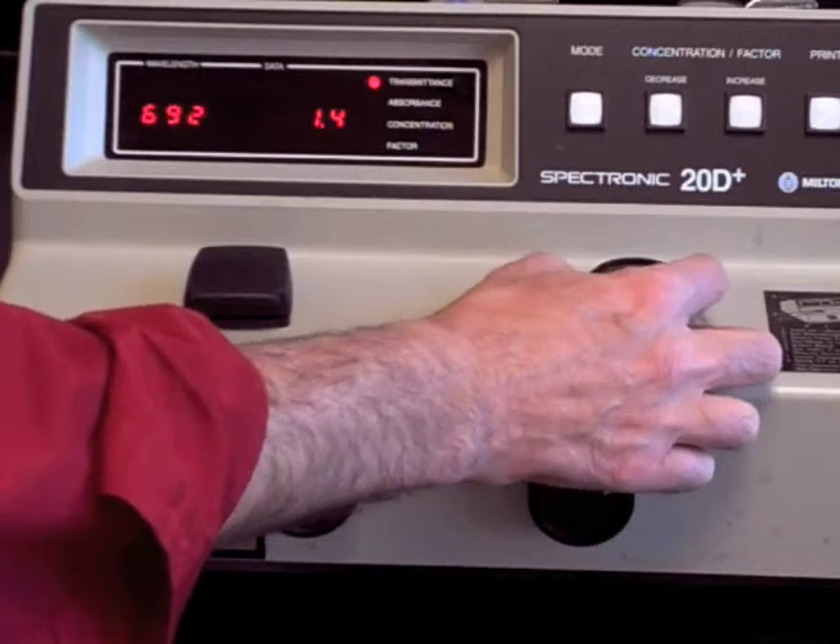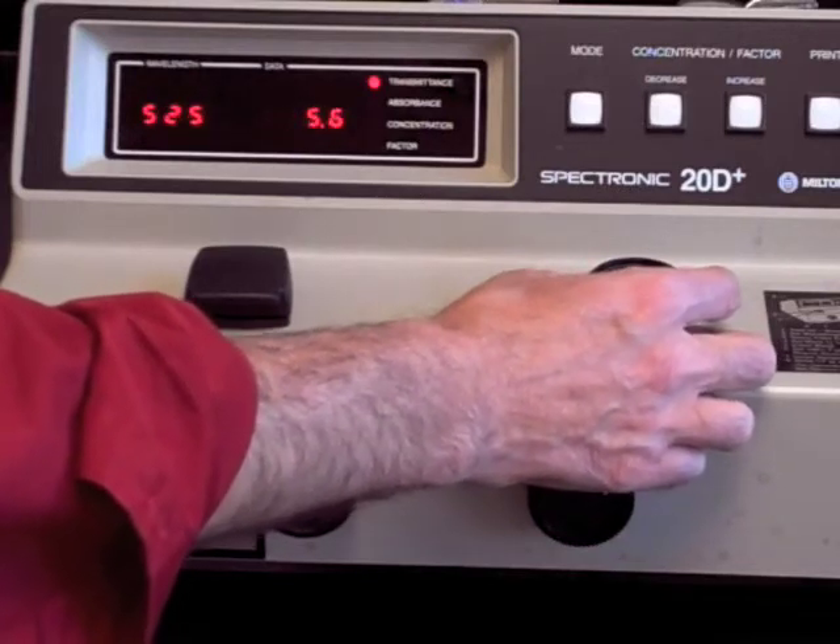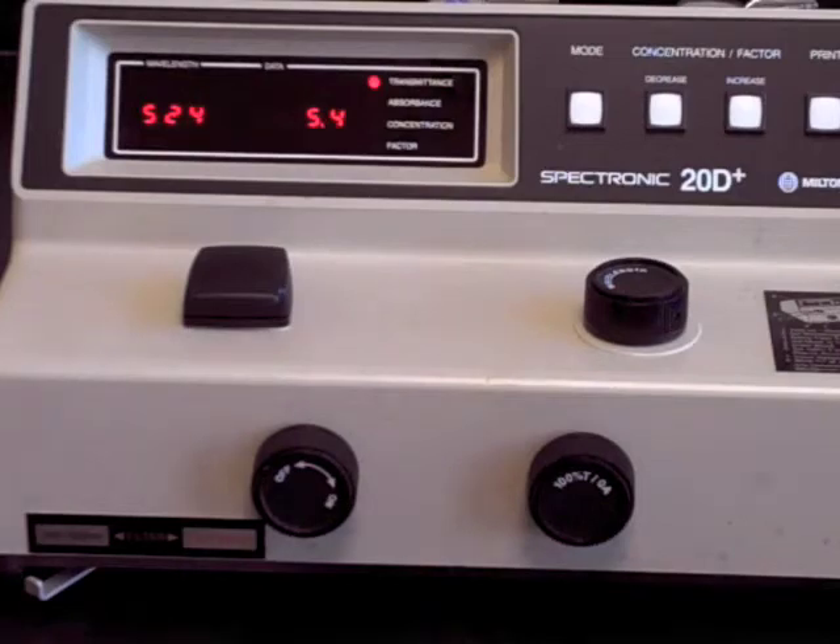Set the operating wavelength using the dial on the top of the instrument. For best performance, allow the instrument 15 to 20 minutes to warm up.